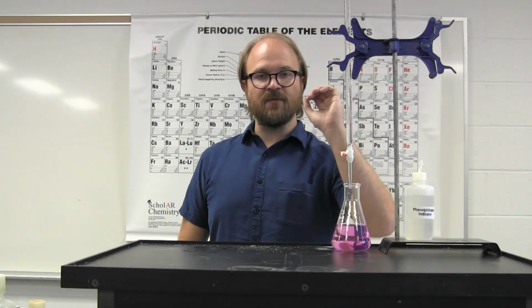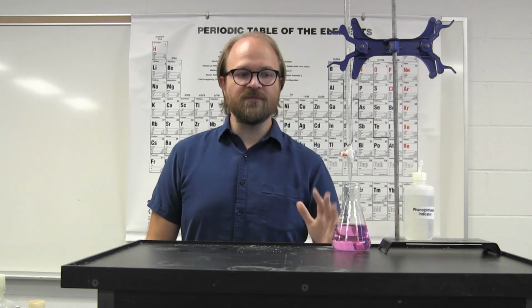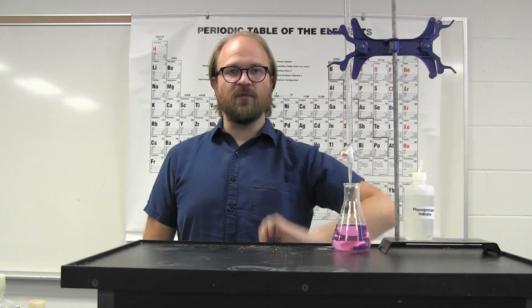You're going to perform a number of different titrations and look at the volume it takes of sodium hydroxide based on the number of moles of potassium hydrogen phthalate. Using the moles of potassium hydrogen phthalate and the volume of your sodium hydroxide, you can obtain a molarity of your sodium hydroxide solution.